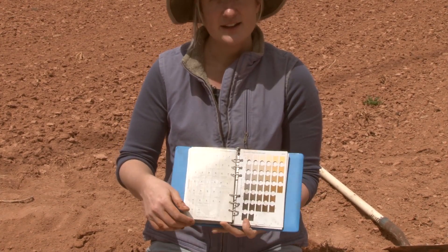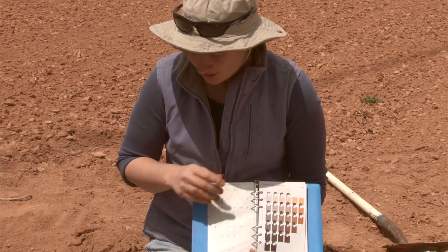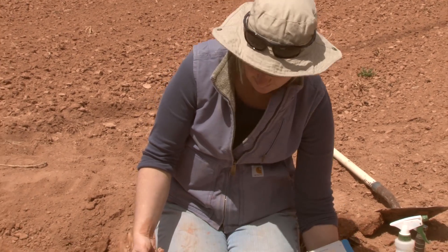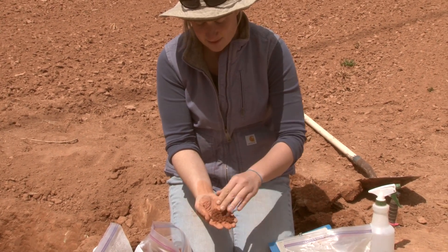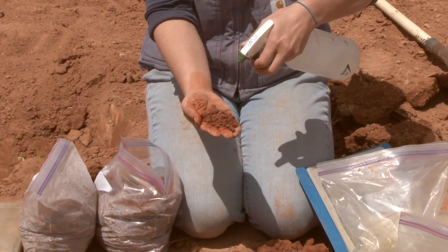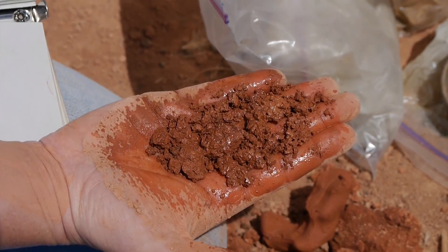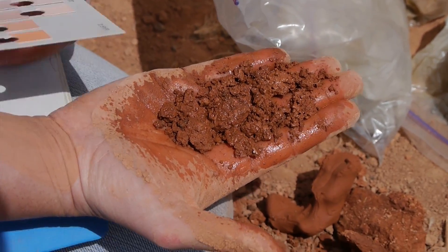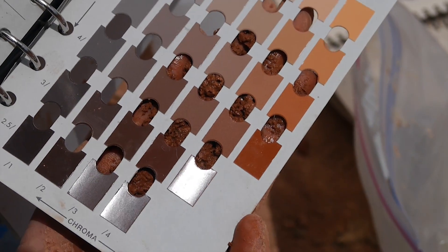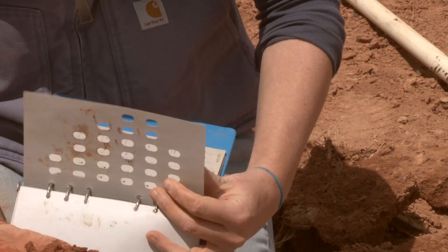Once you've identified the hue page you need to be on, you can take a soil sample to confirm. Break it down so you have a uniform color in your hand and get it wet — not soaking wet, but just wet enough, since it's going to get a little darker. Hold it up against your color sheets and eyeball whether it matches the red tone of the page.